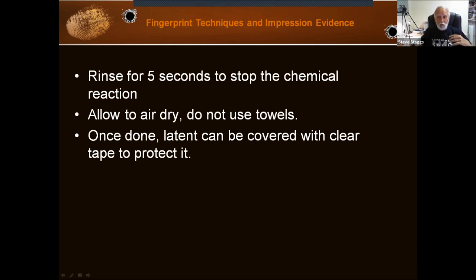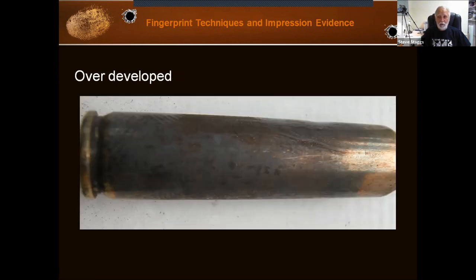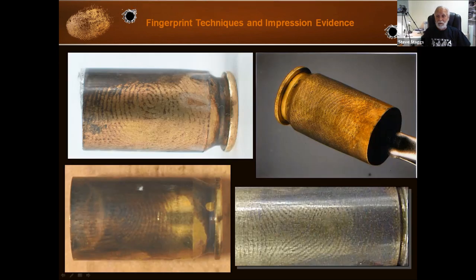When you have it the way you want it, rinse it for five seconds to stop the chemical reaction. Allow the cartridge case to air dry — don't wipe it, don't use towels, just let it air dry. Otherwise you'll damage the print. Once you're all done, photograph it and you can cover it with clear tape to protect it. What happens if you over-develop? This is what you get — not a whole lot of detail. What happens if you do it just right? You get detail that may look like this. That's assuming the print is there. Sometimes you end up with a black cartridge because you kept looking and nothing happened — now it's too dark, and there was simply nothing there.